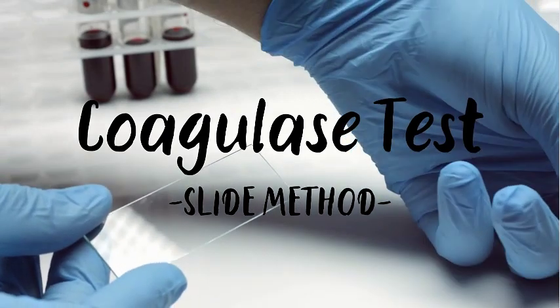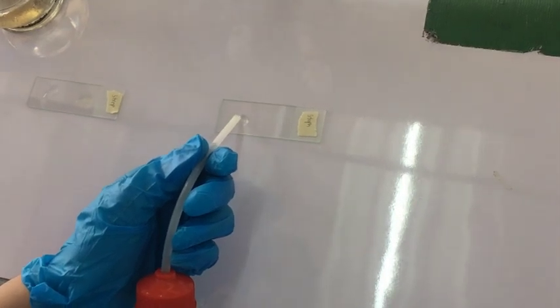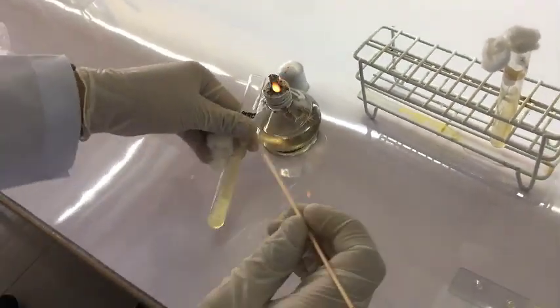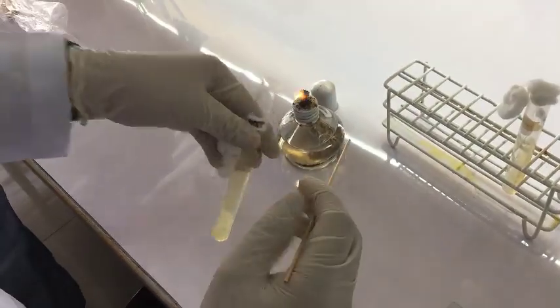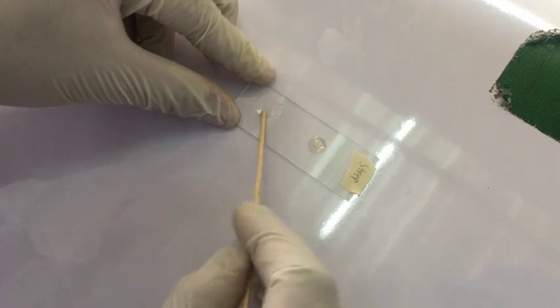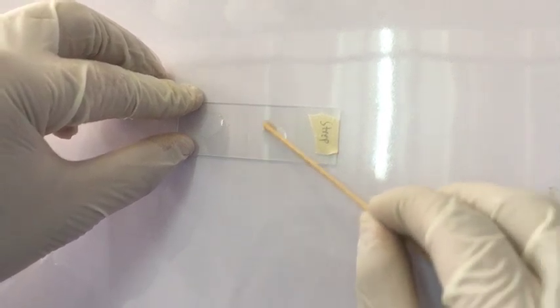The next step is the coagulase test using the slide method. The first is to place a drop of normal saline solution as a control, then place a drop of rabbit's plasma next to the saline. Then get a colony of Streptococcus and emulsify it in each drop on the slide, always placing it first on the saline solution. Using a different applicator stick, emulsify the inoculum into the rabbit's plasma.